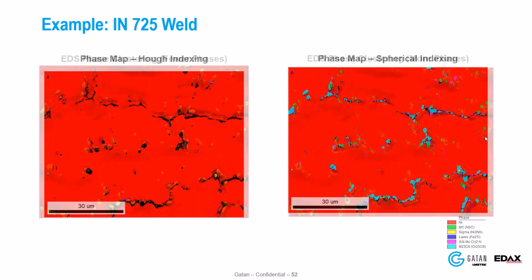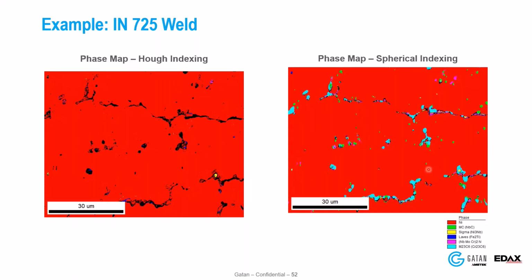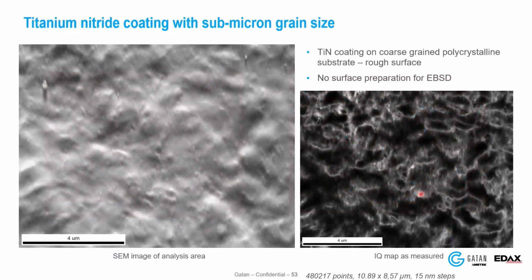You can see the scratches, so it's not a perfectly polished sample. But they're just trying to show that even with that, it's robust enough to not need more sample prep. It's always a hard question of whether you would want to do more sample prep. The better your patterns are, the better everything works.